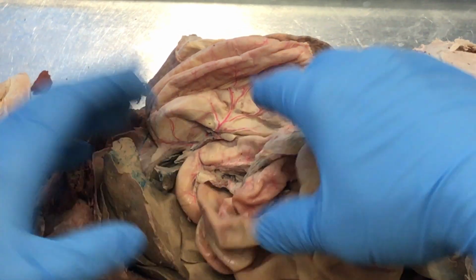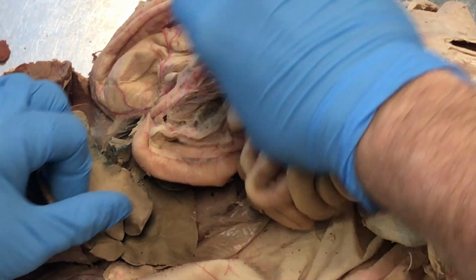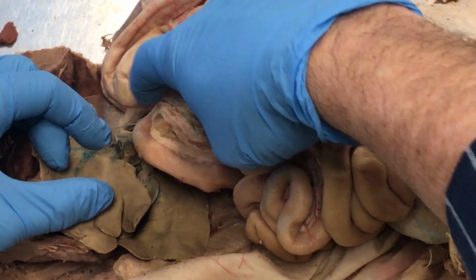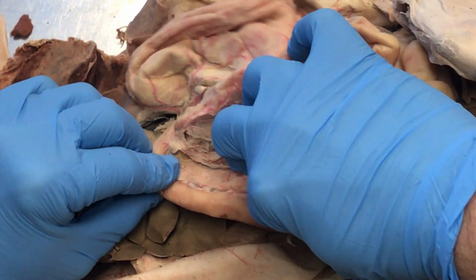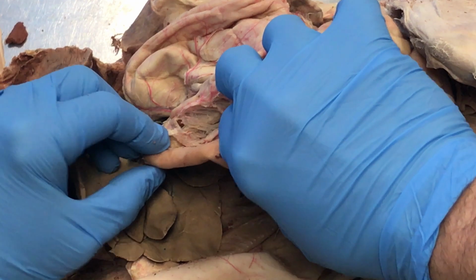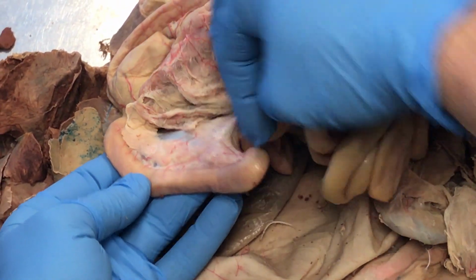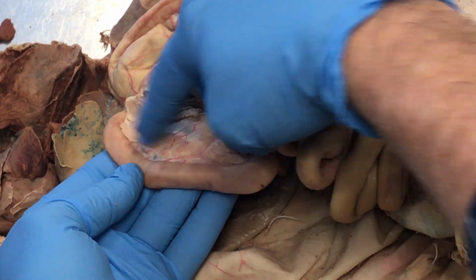Pancreas. All right. Well, here's what we always say. So we've got stomach here. The first part of the small intestine is going to be the duodenum, about a foot long in a human, so it's only about this long. What we always say, whether it's human or cat, is the pancreas sits in the curve of the duodenum. So the head of the pancreas sits up here. This is the curve of the duodenum, and you can see pancreatic tissue. See it right there? Remember from before? That's pancreatic tissue.